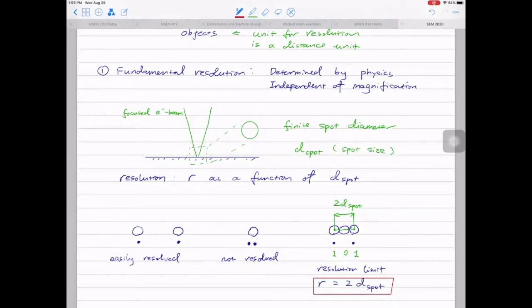Yes, if you go to the highest possible magnification, then let me think about how to address your question. Each pixel probably will not be the resolution. For example, if I zoom out a lot, each pixel probably will be hundreds of nanometers in the micrograph.